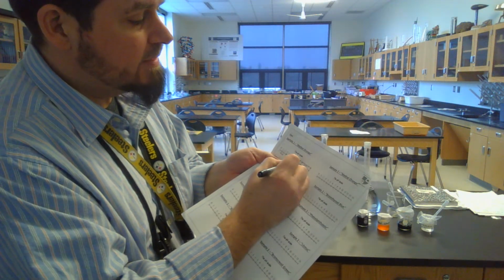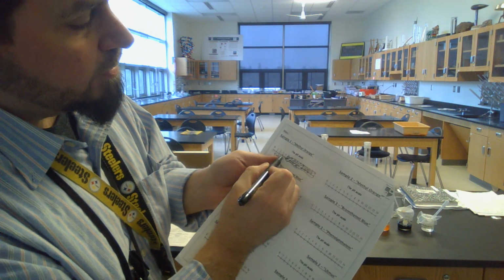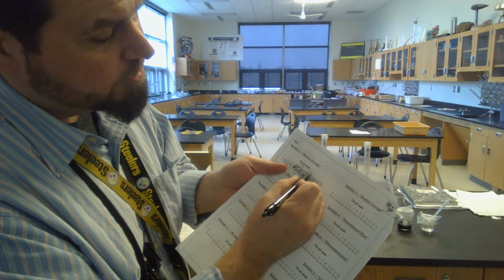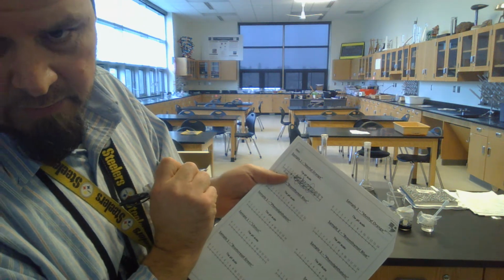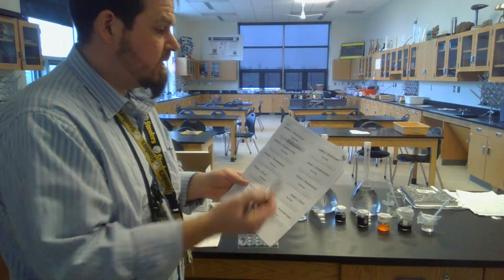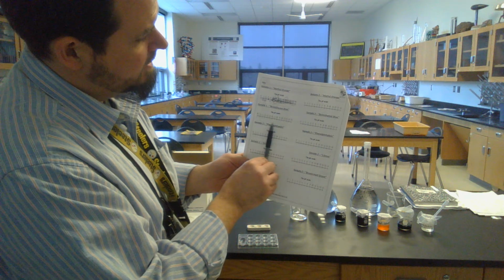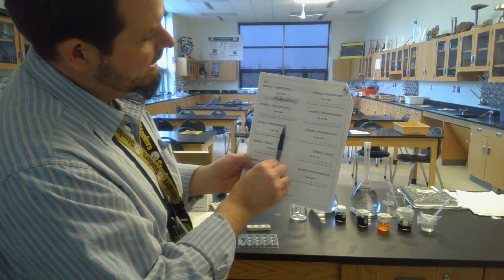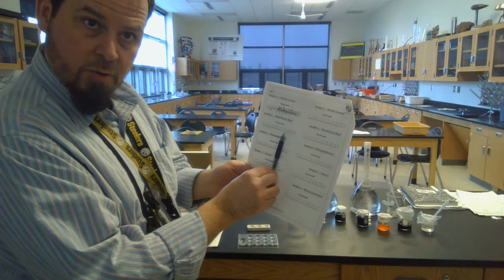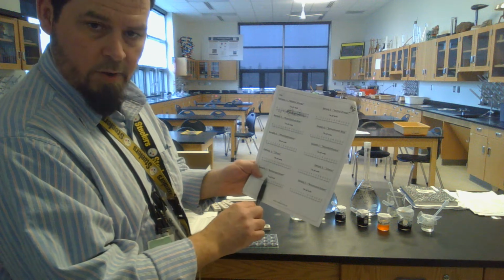Okay? And I want you to box this in because if it comes up yellow, you know that that's greater than 4.4, but you don't know if it's 6, you don't know if it's 10. See what I mean? It's somewhere in there. And here's the way the lab works. After you've done that for each of these, you're going to be able to narrow in and see that most of them match at about this. Where you get the most matches, that's where you'll guess for the pH to be for sample 1.